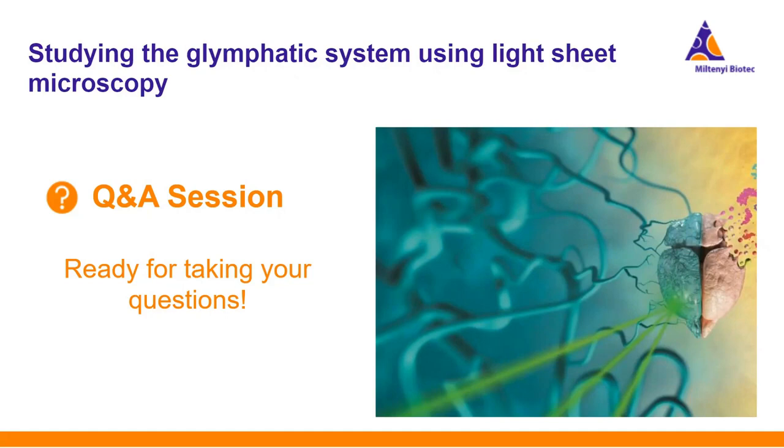Great, thank you, Iben. And it looks like we have one more question that came in, and it asks, how do you titrate antibodies for 3D microscopy? Yes, good question. A little bit primitive, but perhaps a standard way.